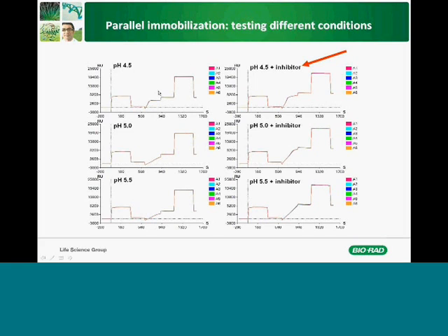also, during the immobilization stage, you need to dilute your protein in a buffer having a low pH, lower than the pI, and therefore the protein is positively charged. Never mind the details now.